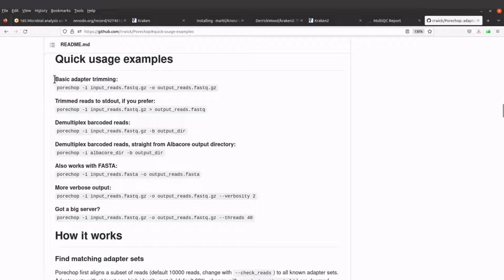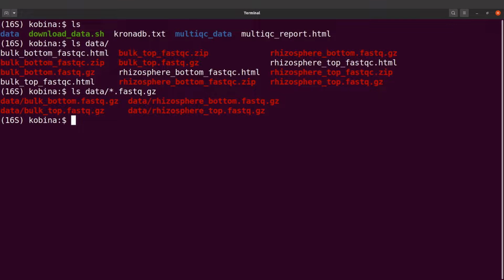Now let's take a look again at our files. From the ls command, we can see there are 4 files. And if you have 4 files, then you have to automate the process. Sometimes you can have hundreds of files, and so it will be better to write a script to process the files instead of trying to write a command for each of the files.